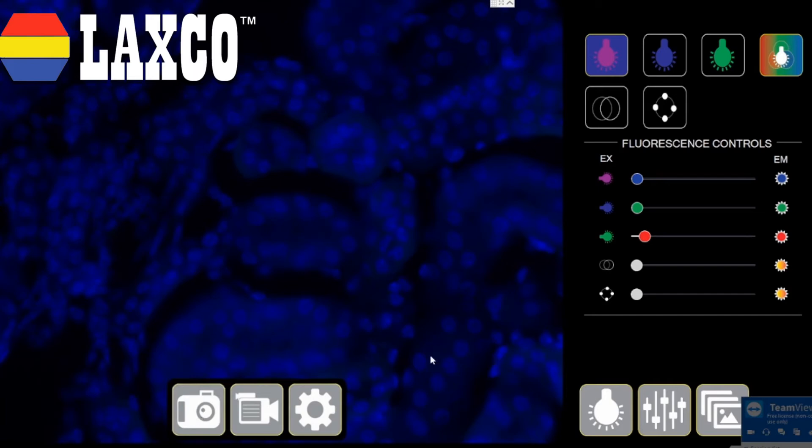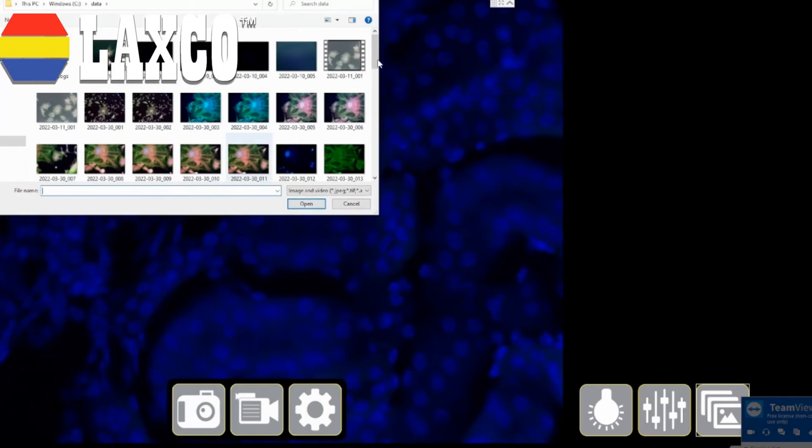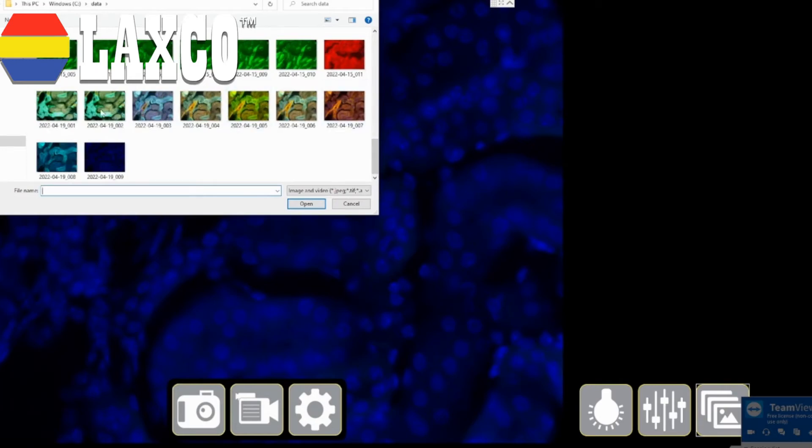I have my snapshot button here. I can click it and take pictures. So I take a snapshot here. And this is my gallery view where all the images get stored. As you can see, I have taken quite a few images, and this image got stored right here. If I double click, I can always get that image back up on the screen.